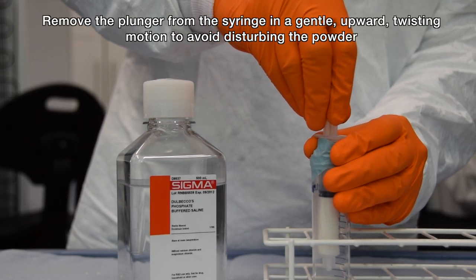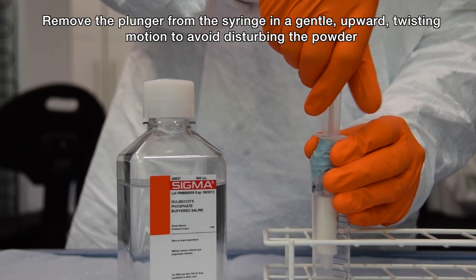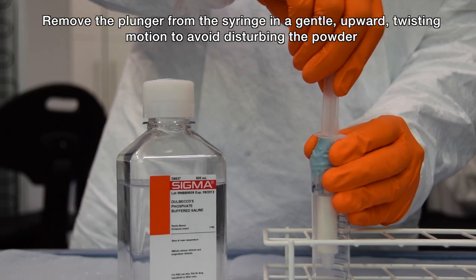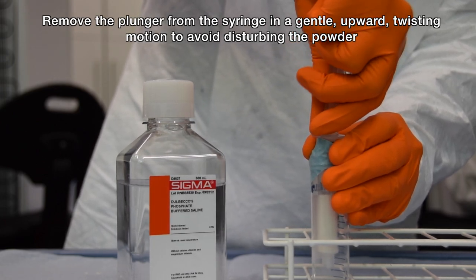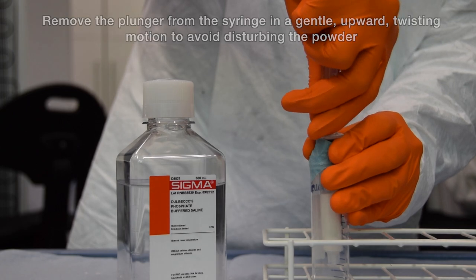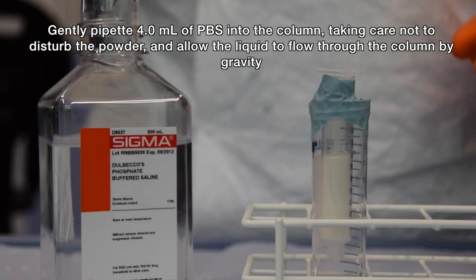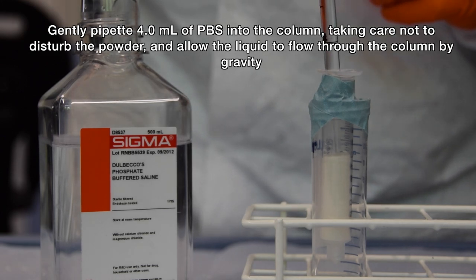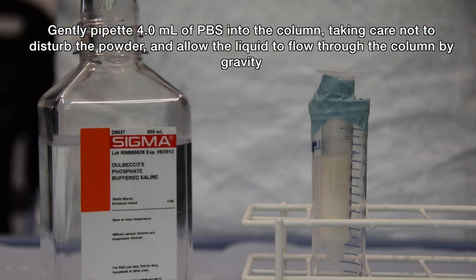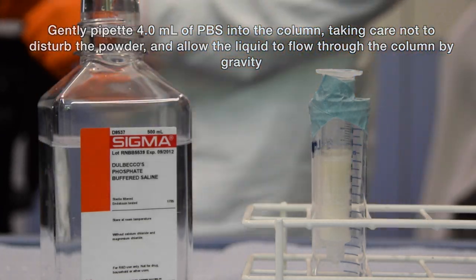While removing the plunger from the syringe, do so in a gentle upward twisting motion to avoid disturbing any powder. Gently pipette 4ml of PBS into the cellulose column, taking care not to disturb the top surface of the powder. Allow the PBS to flow through the column by gravity until no liquid is visible above the surface of the powder.